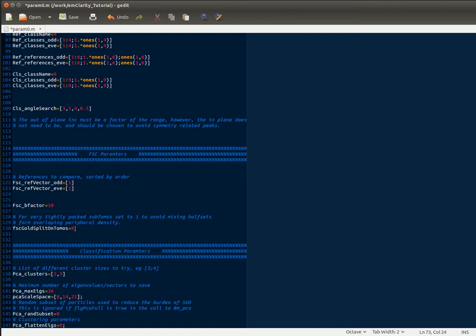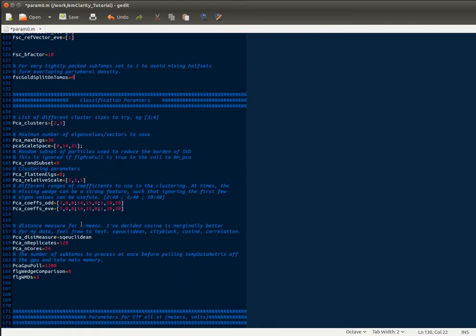If however you have something like a virus capsid where one tomogram may share overlapping information with its neighboring subtomogram, just dividing randomly isn't good enough because then even though you may have split and kept things two separate, two neighboring particles if they're in opposite half sets can share information and overlap. So if you have something where that might be the case—any kind of pseudo-symmetric lattice—you would change this to one, and what that does is it divides the even and odd half sets based on the tomogram they came from. So everything in a given tomogram will be either even or odd. So obviously if you only have one or two tomograms this is not going to work as well, but that's just the name of the game.